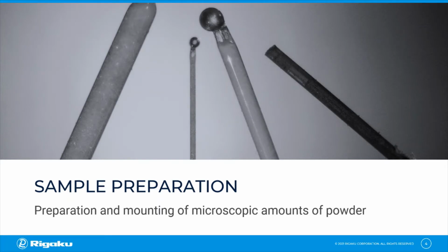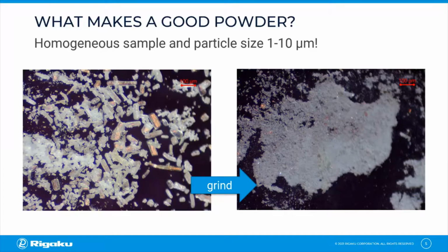But today we will focus on the collection of powder data for qualitative and quantitative analysis, and we will start with the sample preparation. Most sample preparation will be performed under the microscope, which will be present in most single crystal laboratories. Here we can get a good estimation of the crystallite size.